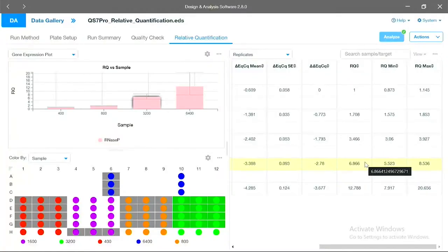Yeah. Right. We can look at it. But the big difference, and hopefully I mentioned this at some point today, is that when you're working with TaqMan assays, you're actually going to degrade that probe to generate your fluorescence signal. So that is inherent. We're not going to be able to go back and reassemble that probe and turn off the signal so we can turn it on, which is really important for a melt curve.